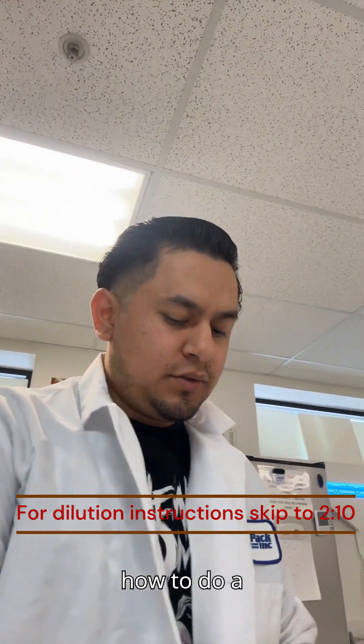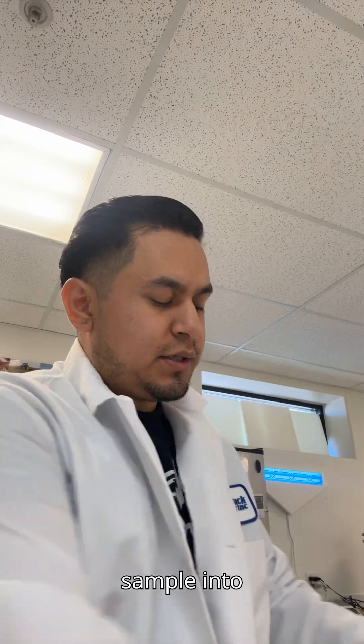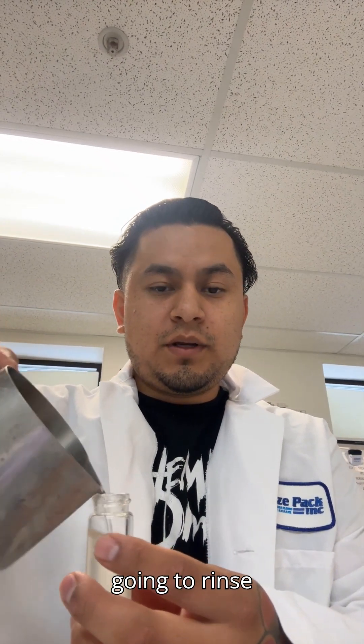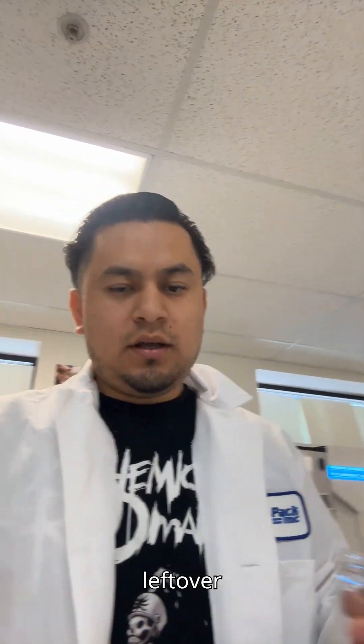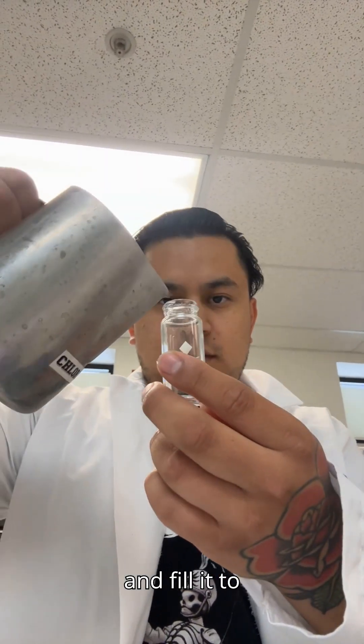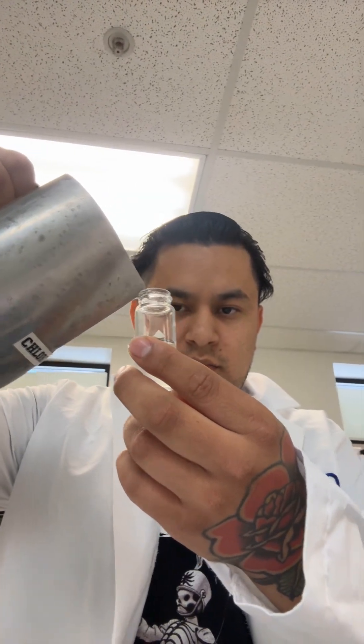I'm going to show you how to do a chlorine test using the DR 300 machine. First, you're going to grab your sample into the glass vial. You're going to rinse it out, make sure the leftover residue from the last sample is all gone, and fill it to the 10 milliliter mark.